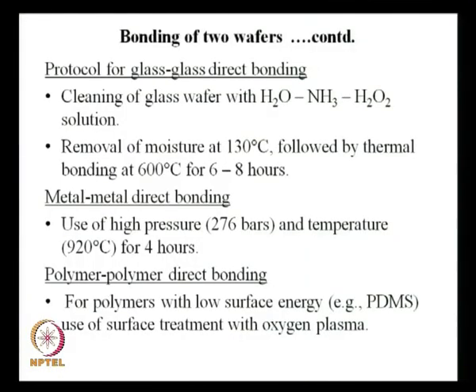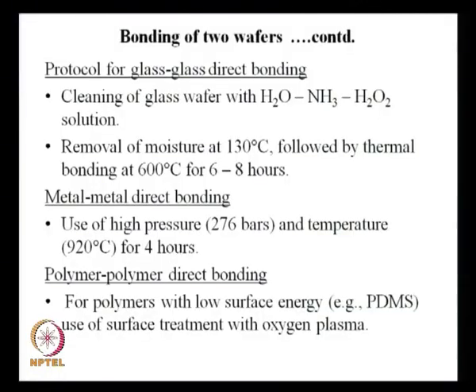However, because of the low surface energy of PDMS that we discussed before, you take advantage of it by peeling this PDMS layer from the mold. That same problem, this low surface energy, can be improved by treating this PDMS layer in oxygen plasma. Put it in a plasma asher and use oxygen plasma, so that the surface is treated, and then you put them together.